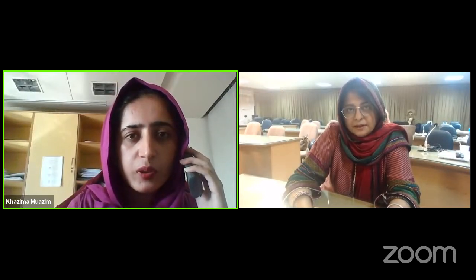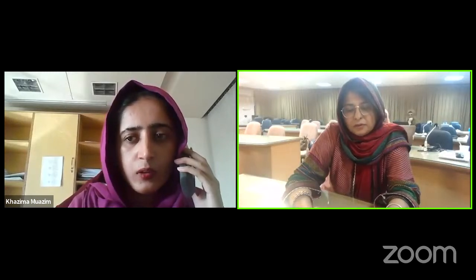Yes, for the explant selection, I already mentioned before that it depends on your desired experiment, whether you want to grow it for micropropagation or for any other experiment. For example, in the case of transformation, you need to grow the callus first. That is called indirect organogenesis. So for that purpose, you need to choose the leaf or stem part as the explant, and then you can proceed further to callus induction.